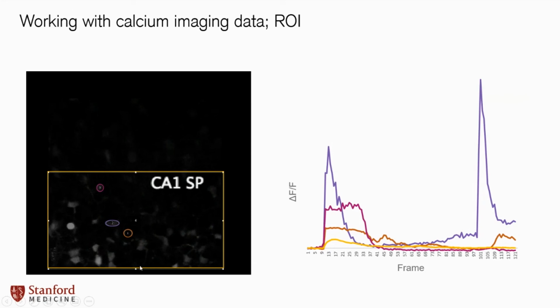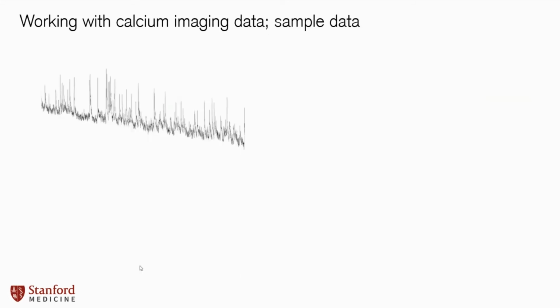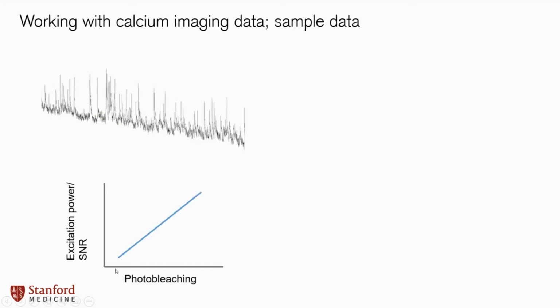The idea being, I highly recommend, if you're interested in animal work, moving towards calcium imaging and having your ultrasound come in concert with that imaging. A little bit more about how to work with it specifically with ultrasound. Here's one of my own calcium traces from an experiment. You can see that it declines over time. So that's actually photobleaching.